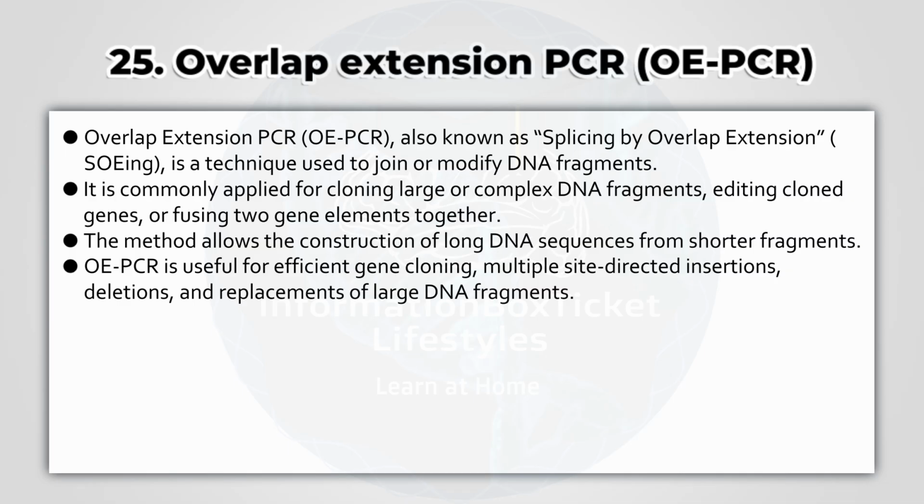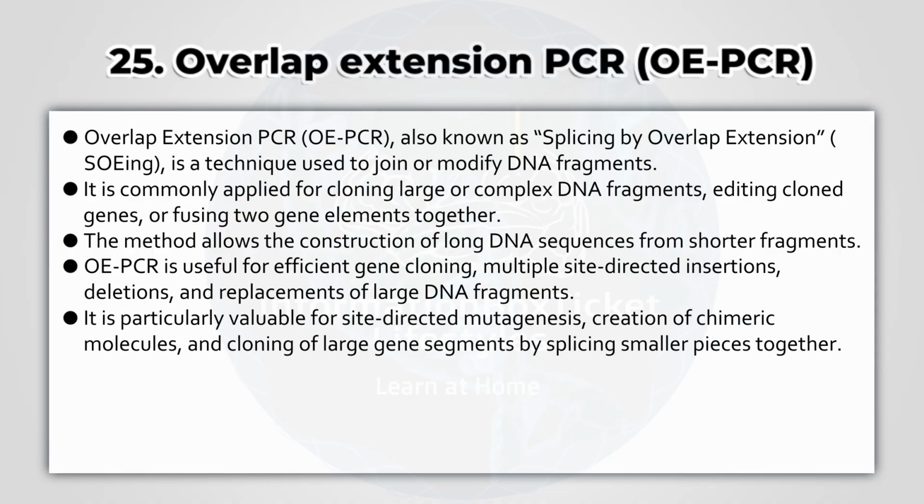OE-PCR is useful for efficient gene cloning, multiple site-directed insertions, deletions, and replacements of large DNA fragments. It is particularly valuable for site-directed mutagenesis, creation of chimeric molecules, and cloning of large gene segments by splicing smaller pieces together.